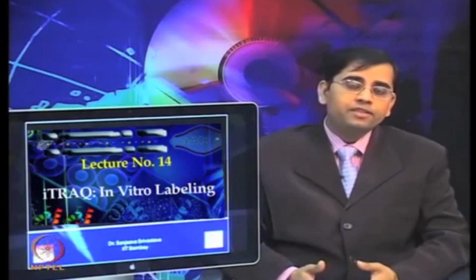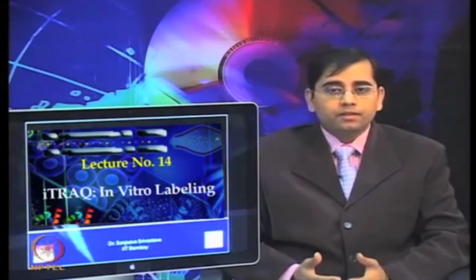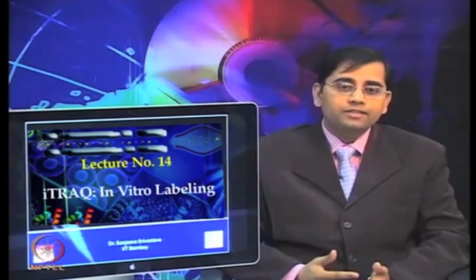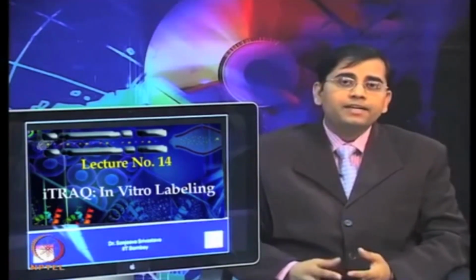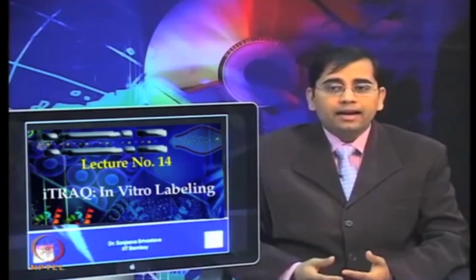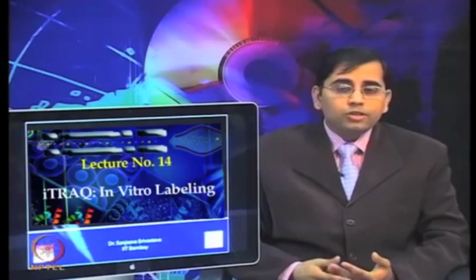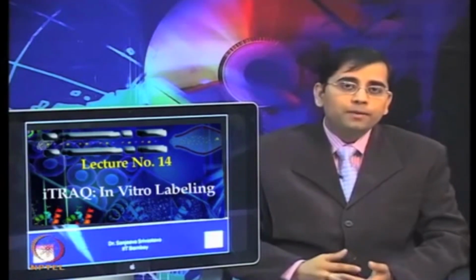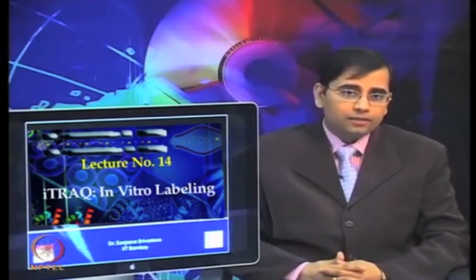Two samples treated with ICAT reagents, light or heavy isotope, D0 or D8, were selectively alkylated for cysteine residues. These samples were combined, trypsin digested, affinity purified based on avidin, and then analyzed by an LC-MS based approach. So, the ion abundance ratio of light and heavy isotope labeled peptides could provide the relative abundance of these proteins.